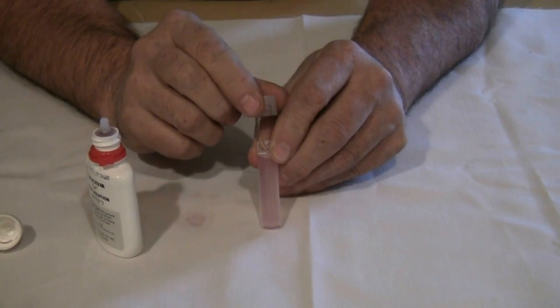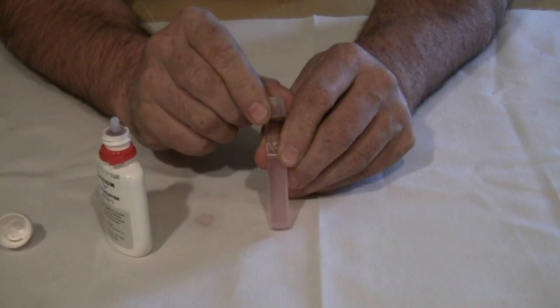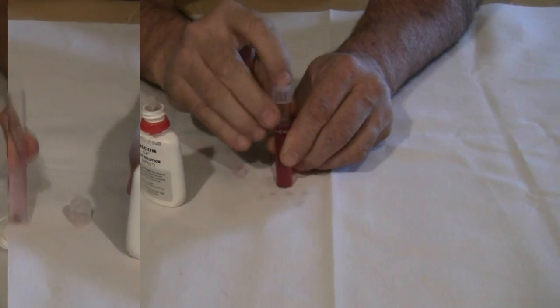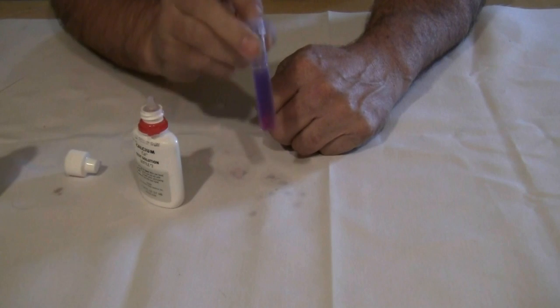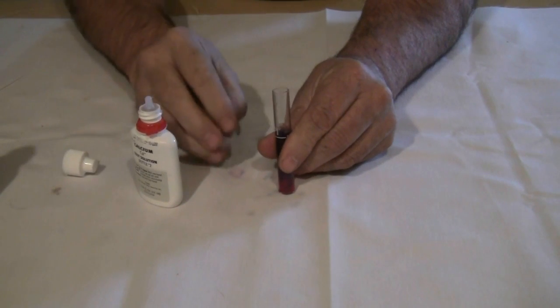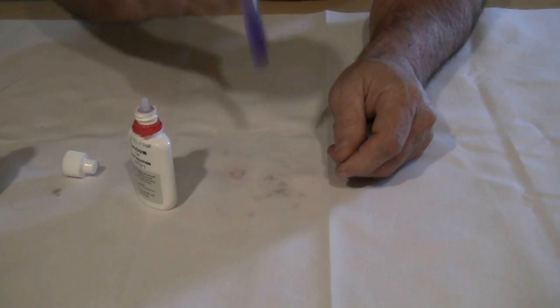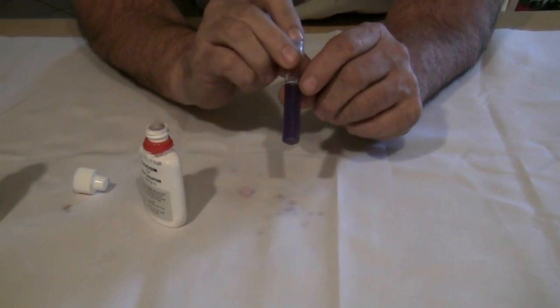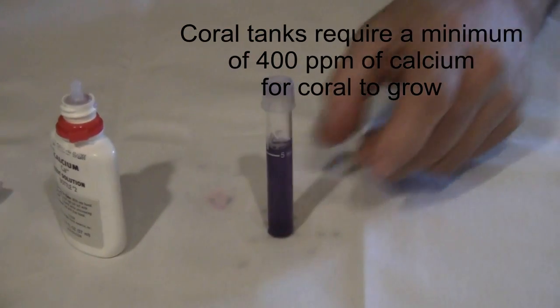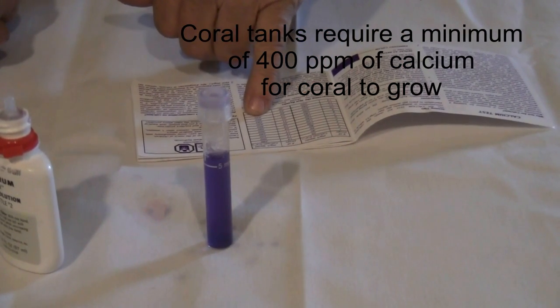Hopefully you can see our water is beginning to turn pink. What we need is when our water turns blue — that will determine what our calcium level is — so we have to keep track of the number of drops we put in. At 23 drops we are starting to turn blue. At 24 drops, there we are — 24 drops. Now we look at our chart and 24 drops means our calcium is at 480 parts per million.